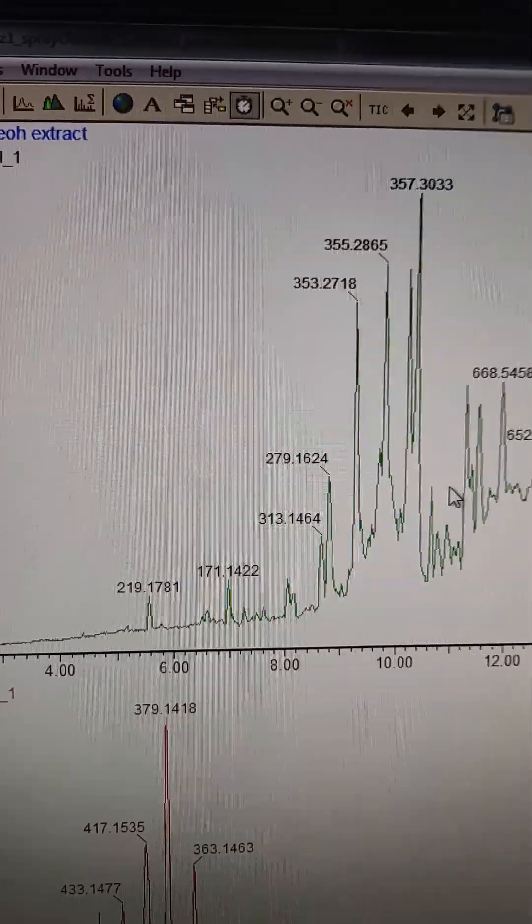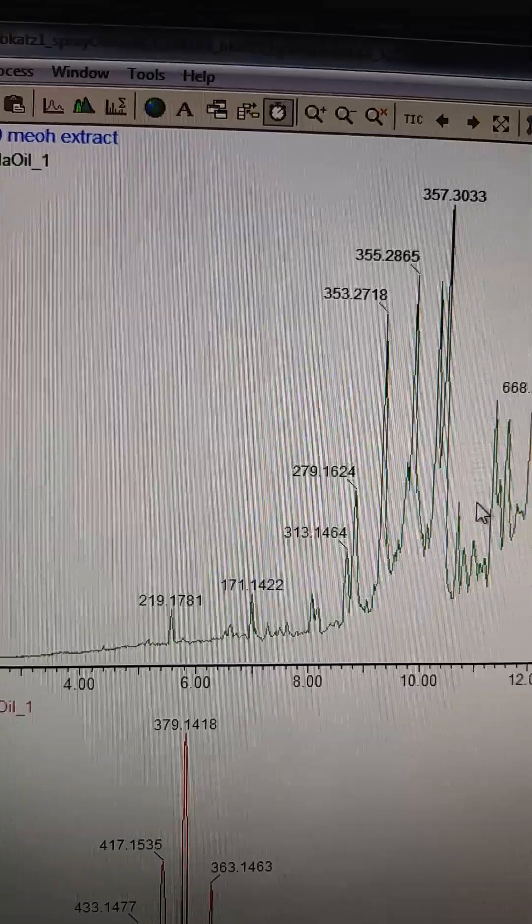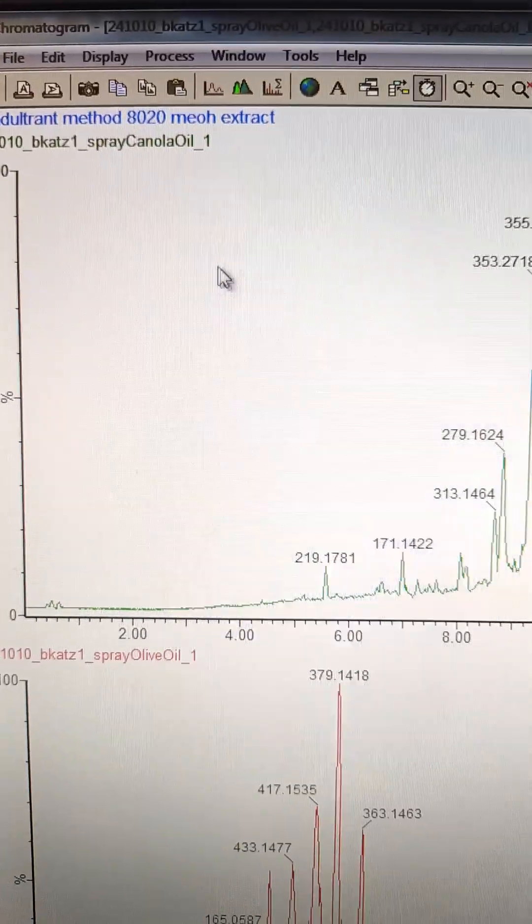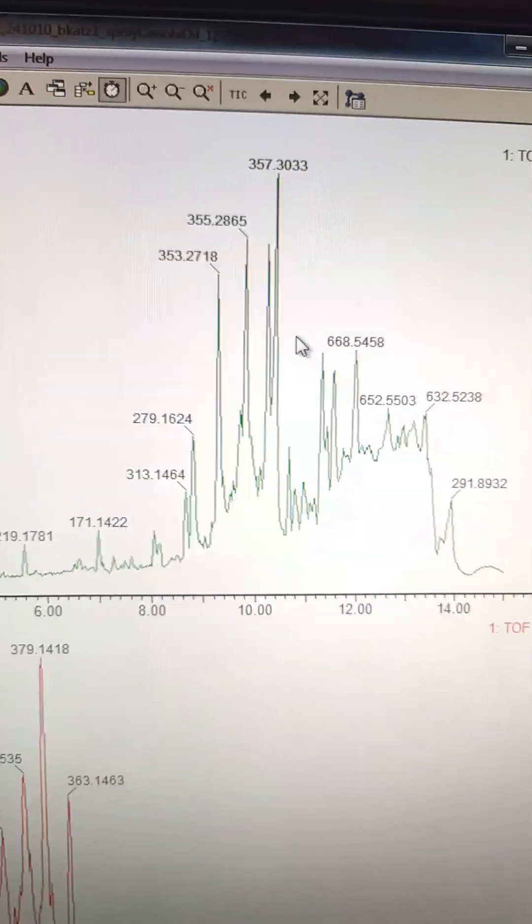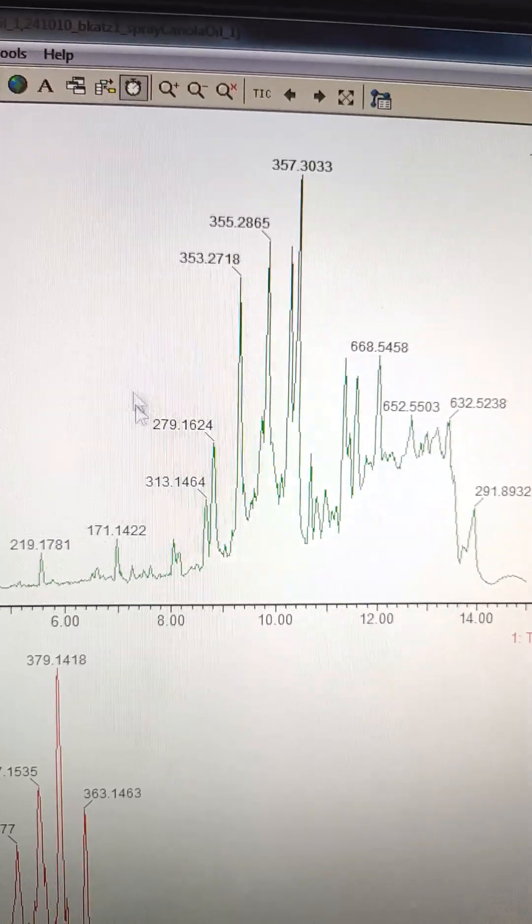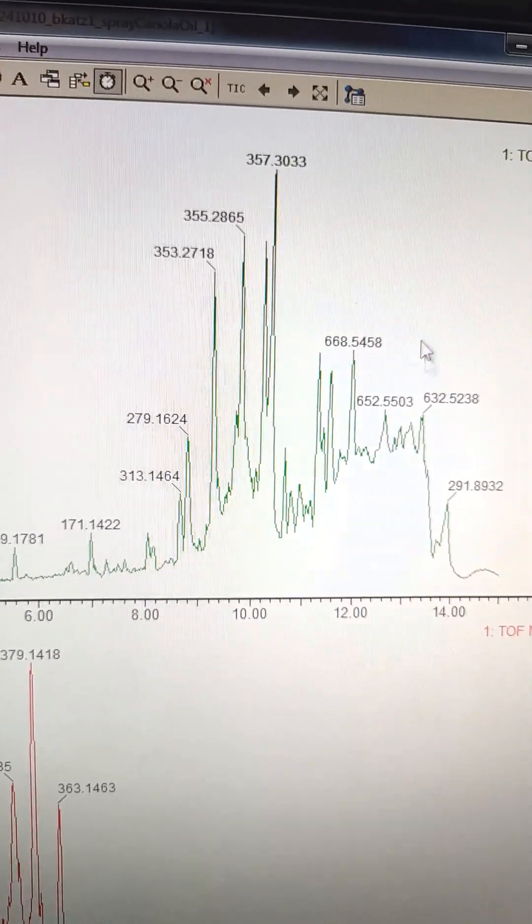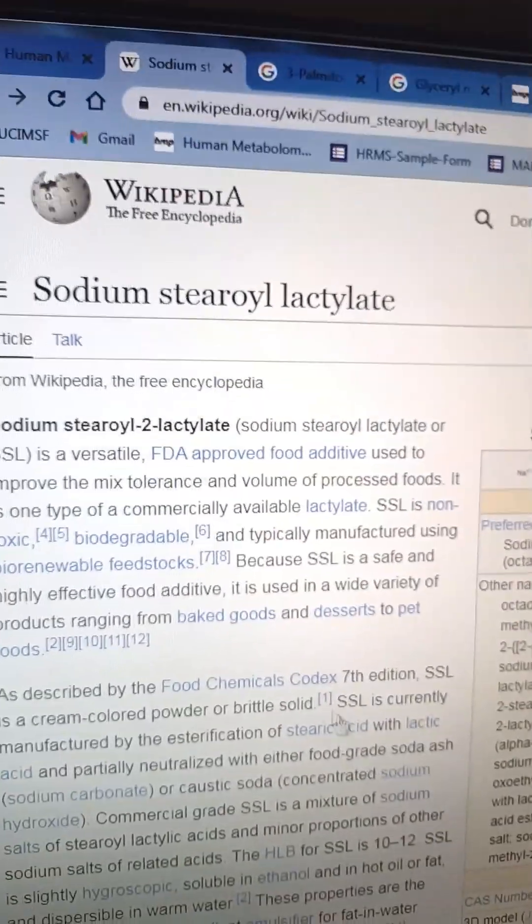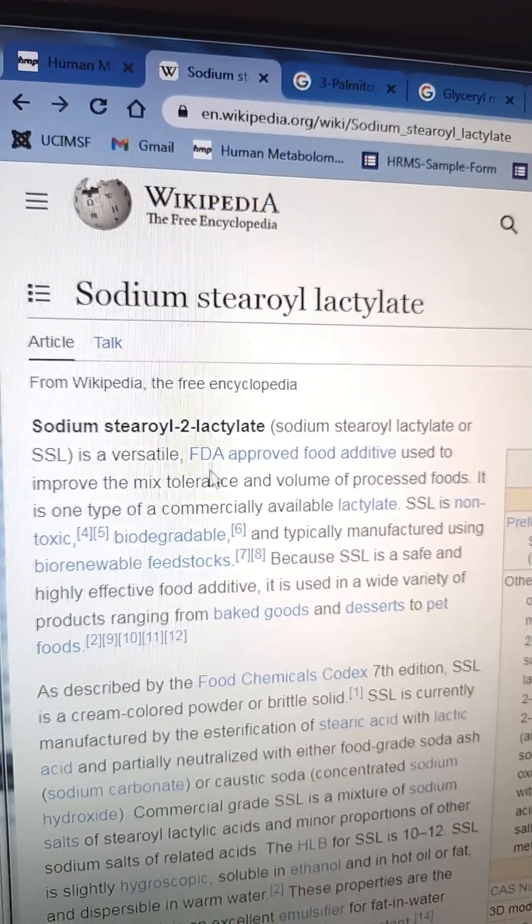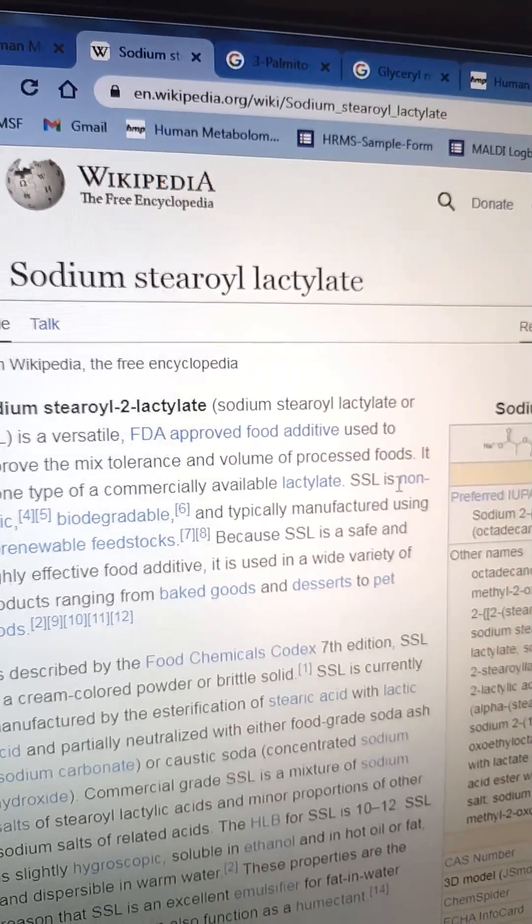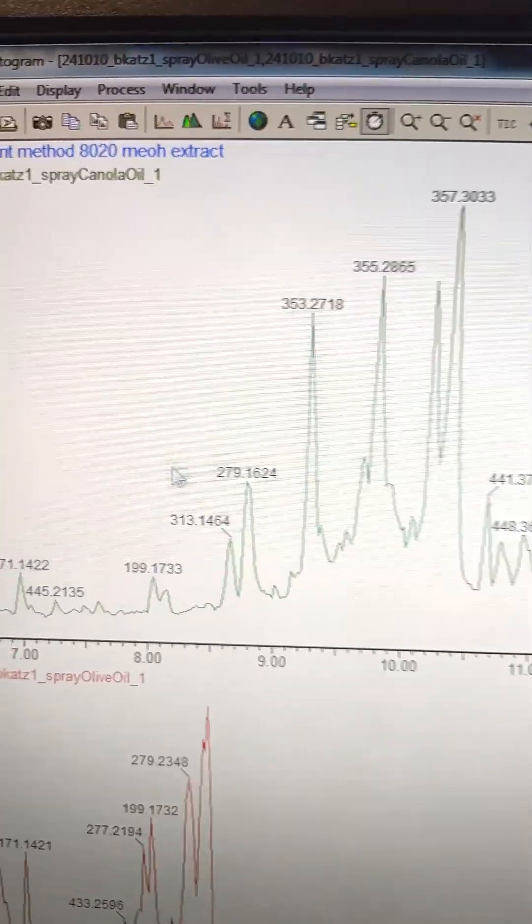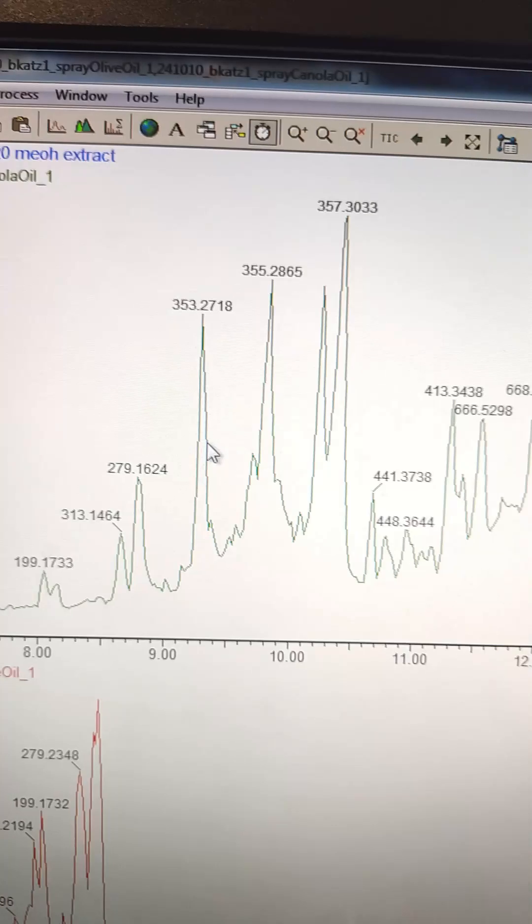So the canola oil has finished running. And you can see there's not a lot of polar stuff in the canola oil, but there's a lot of non-polar stuff. So these are going to be the fatty acids conjugated with different things. And as I was saying, we have sodium stearoyl lactylate SSL.